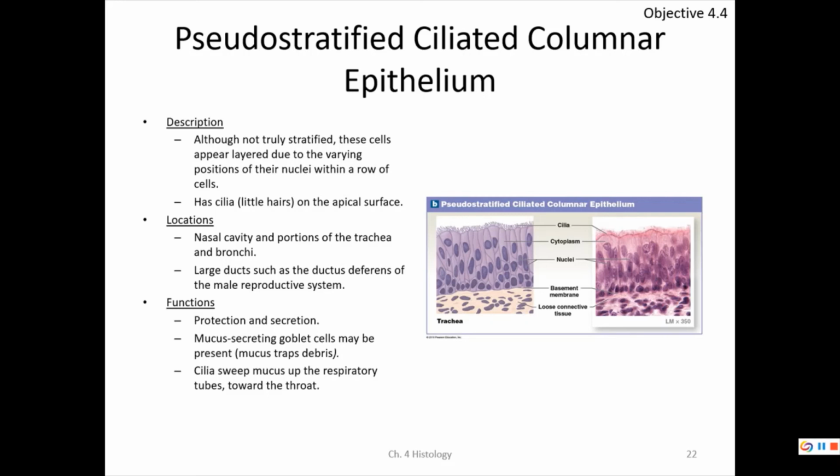So yeah, but also it's in the vas deferens, ductus deferens or vas deferens. Is there a difference between males and females?